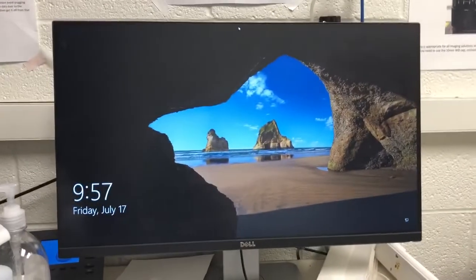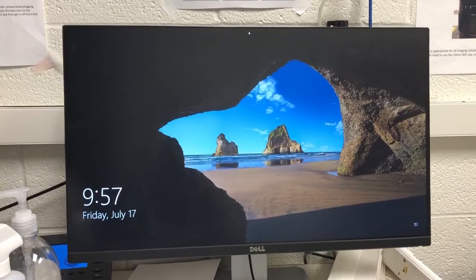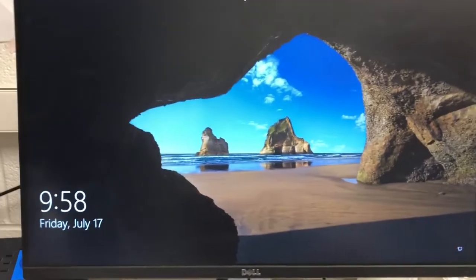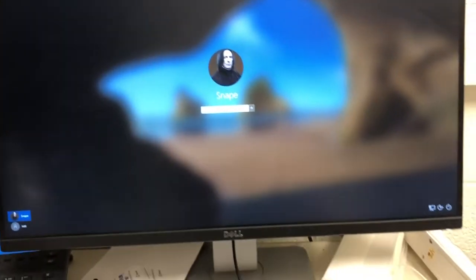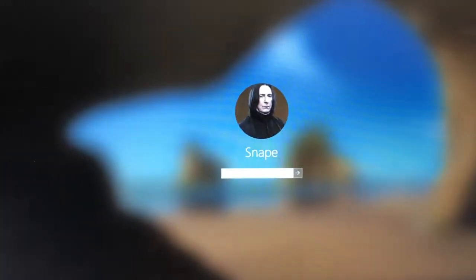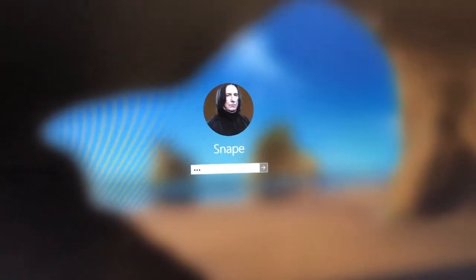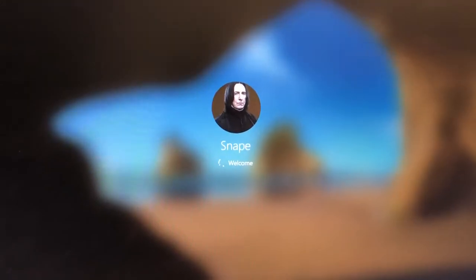Make sure the computer is on — this computer should always be left on by everyone. If the person before you forgot and turned it off, the CPU is down here and that's the on-off button. But people have been following procedures well, so this is on. This computer has two usernames: Snape and LVBT. Snape is the nickname for this computer. The password is MSL.